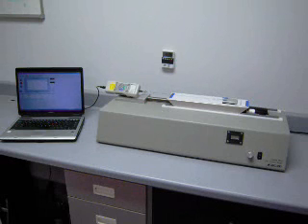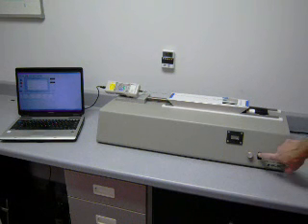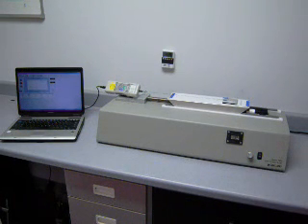Start the drive mechanism to provide a plane versus sled speed of 150 millimeter per minute. No immediate relative motion may take place between the sled and the moving plane until the pull of the sled exceeds the static frictional force acting at the contact surfaces. Record this initial maximum reading as the force component of the static COF.